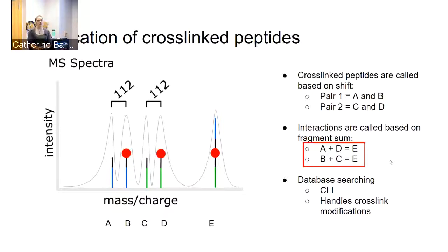You mean like a way to, so, I don't think you could say it has a primer so much as we know the crosslinks will only react with primary amines. So typically you're going to see it at lysine residues. Is that kind of what you're thinking? Yeah. Right, but lysine residues, depending on their accessibility on the protein, they may or may not be cross-linked. So just looking for those isn't exactly enough to be able to pull them out. So will it also link the N-terminal of the protein?